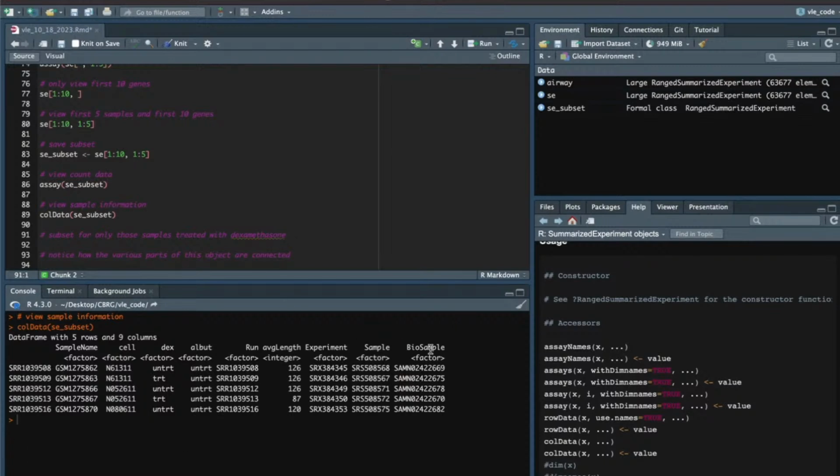And this is remarkable. So the alternative to this would be, for example, if you had your assay data in one data frame and your sample metadata in another data frame, anything you do to the first data frame is not going to be reflected in the second data frame, as in any changes you make. Similarly, if you had your assay data on sheet 1 of an Excel sheet and your sample metadata on sheet 2, you remove the first 5 columns, or you only keep the first 5 columns for the Excel sheet 1.